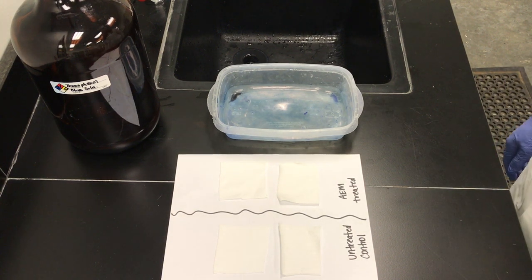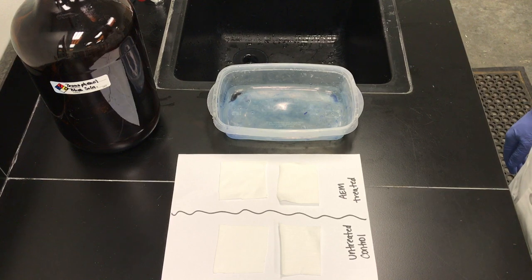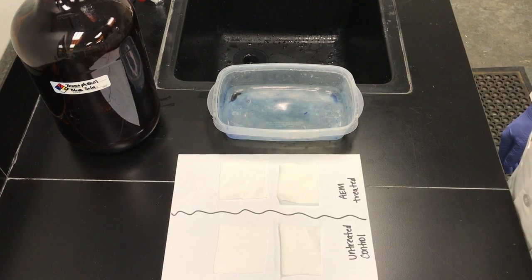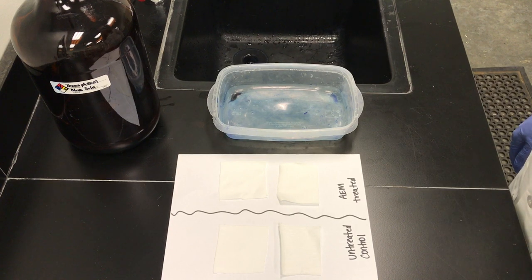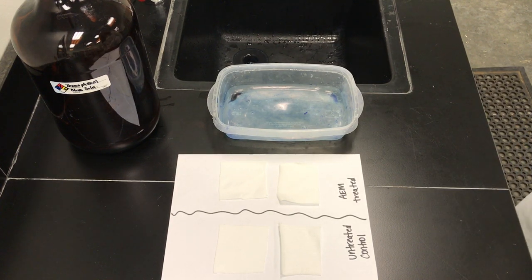The bromophenol blue or BPB direct stain is a quick and easy screening tool to determine if there is AEM treatment on a surface. In just a few basic steps one can quickly verify that AEM was applied to the fabric or other substrates.